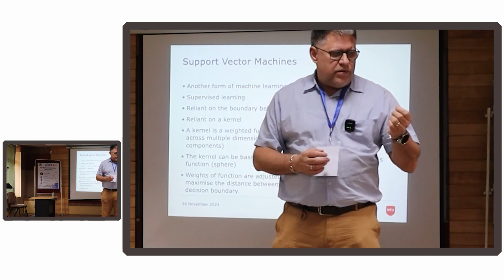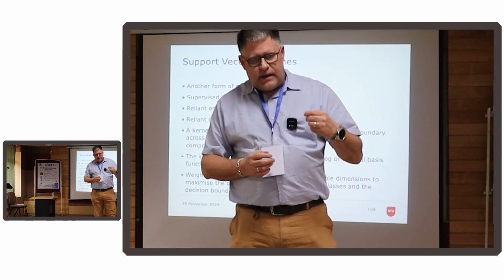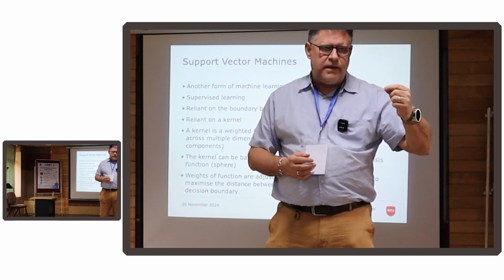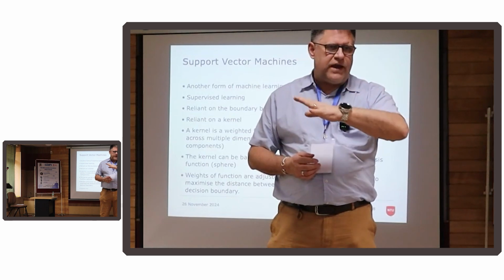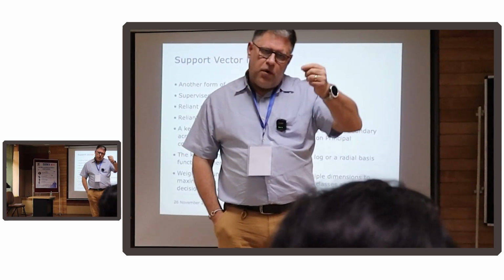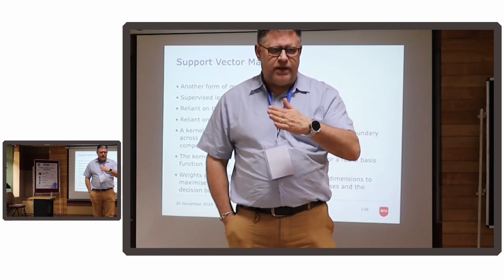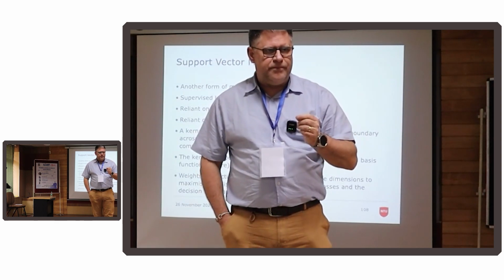But essentially the method we use is we look at each feature on its own in the first instance across the data set. We look at its ability to model an answer to a question. So say you have disease healthy and you've got all these variables.